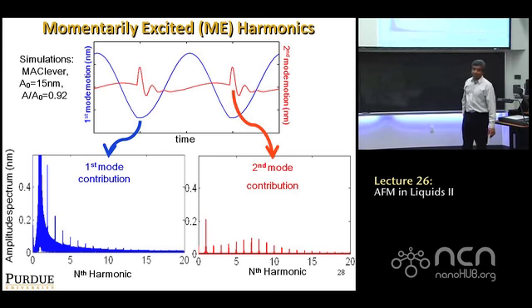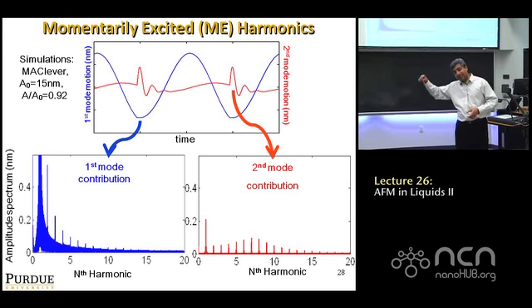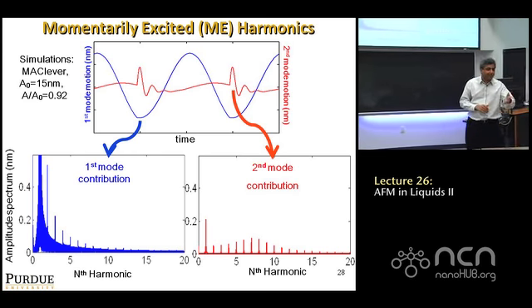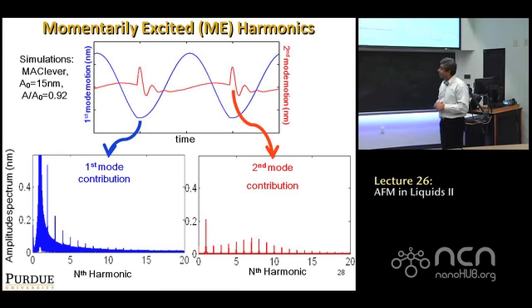The blue is how the first eigenmode oscillates as you tap on the sample. The red is how the second eigenmode is moving, that each time you tap, it rings and dies out, rings and dies out. And so what we're trying to capture is a little ringing of the red curve. And the more it is, the stiffer the sample, the less it is, the softer the sample, right? How are you getting the sound? How do you get the sound is the question.